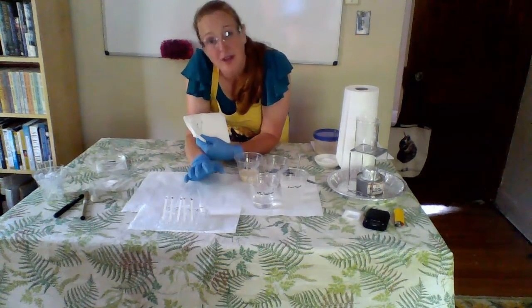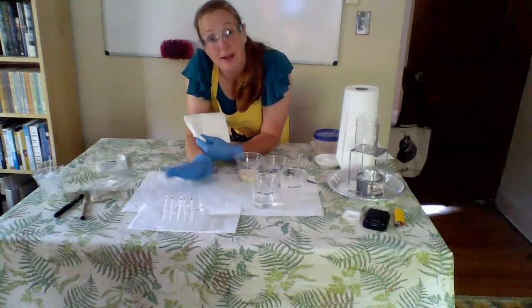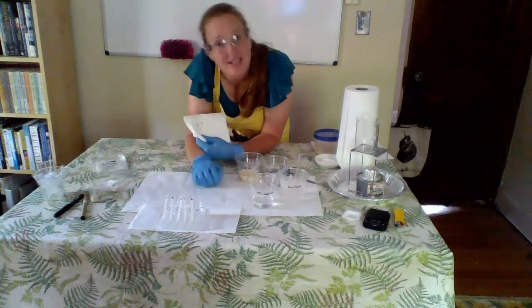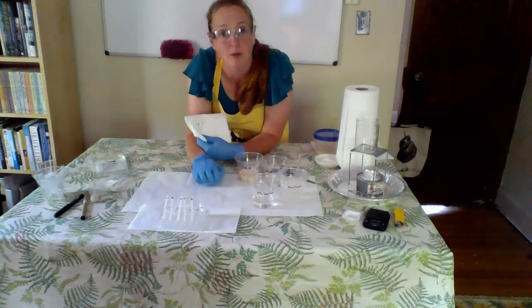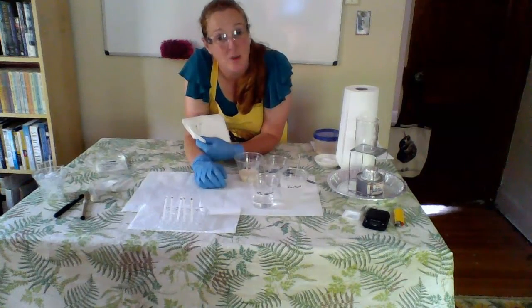So, now that you've got, hopefully, a feel for how this enzyme works, you're ready to move into the next part of the experiment where we get to play around with this enzyme. We get to really test its boundaries. How far can we push it before it starts to denature, before it starts to change shape and it will no longer work for us? And that's when things get really interesting, is where we start to find those limits of where something like lactase can work and can function.